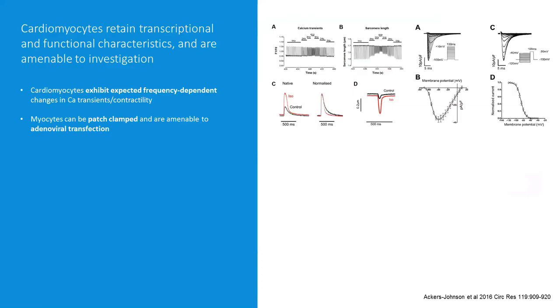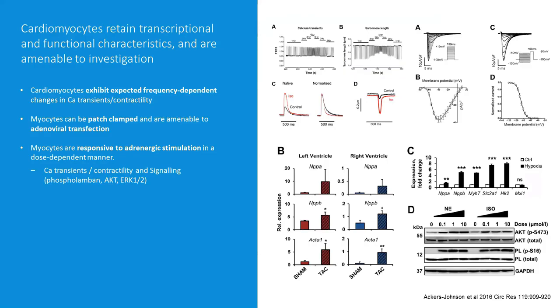We've shown that they can be patch clamped. In this case, we measured sodium currents. We've shown that they are amenable to adenoviral transfection. We showed that they're responsive to adrenergic stimulation in a dose-dependent manner, and this was done using calcium transients and contractility, but also in terms of signaling, by looking at phospholamban phosphorylation, AKT and ERK1/2.